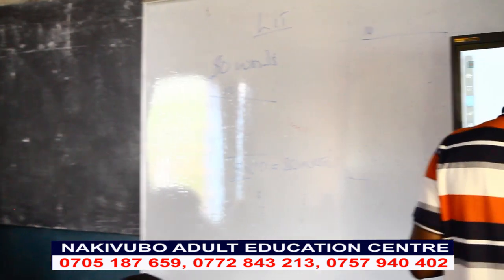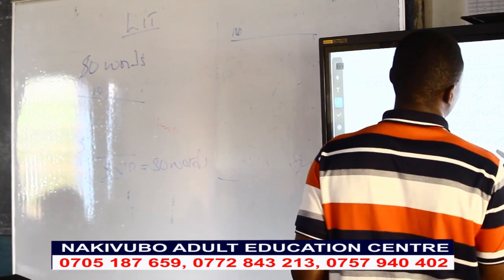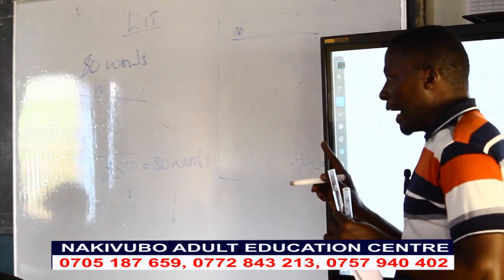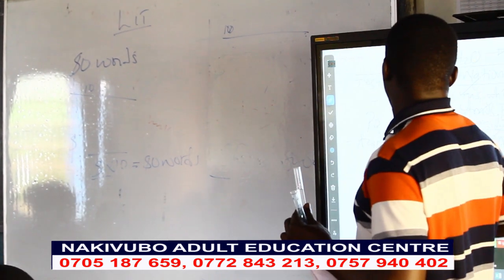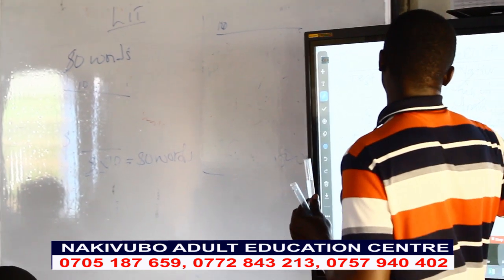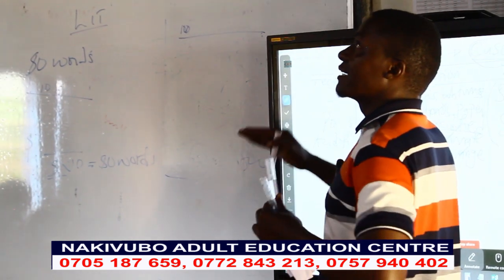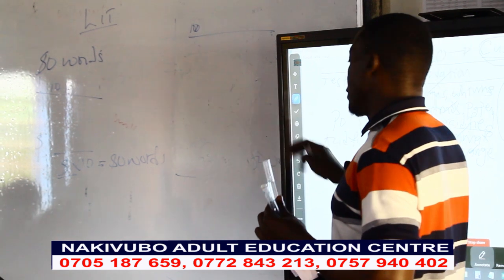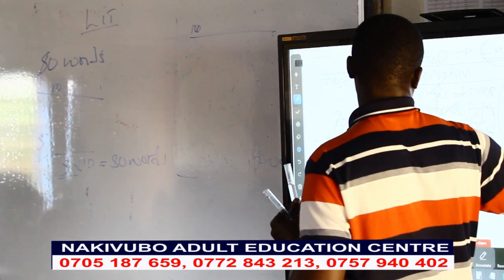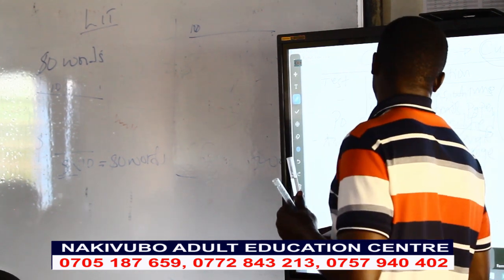So this is what you need, the main. If you say acidic gas present, when you have given this observation, the deduction may not be connecting with the observation. Because when it's acidic gas, there is carbon dioxide gas, yet the observation you have given is not connecting with carbon dioxide. So here you try to be specific: sulfur dioxide, because it is connecting with the observation you have given.